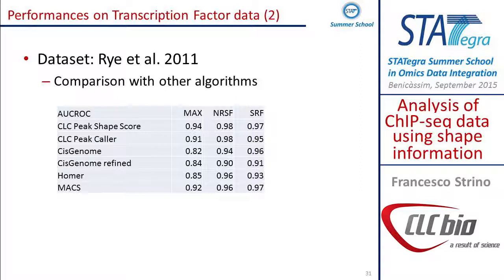So I would say there is not a very big difference if you run a peak caller. The advantage that we have is that if you run the score, since it's base pair resolution, you can actually get a higher auROC just because you call every peak. That looks slightly higher, but it doesn't really affect you unless you want to find very weak binding. So that's about it.